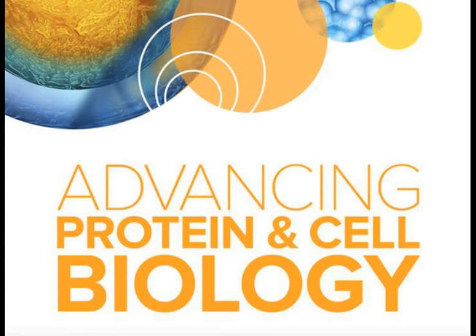I remember there's another question on the time lapse. I remember that one of the data you published was on just doing cells and sphere formation over time without a stain. Have you also done it with stains? Have you done the live cell measurement with stains? We have not done it, but it is possible, yes.